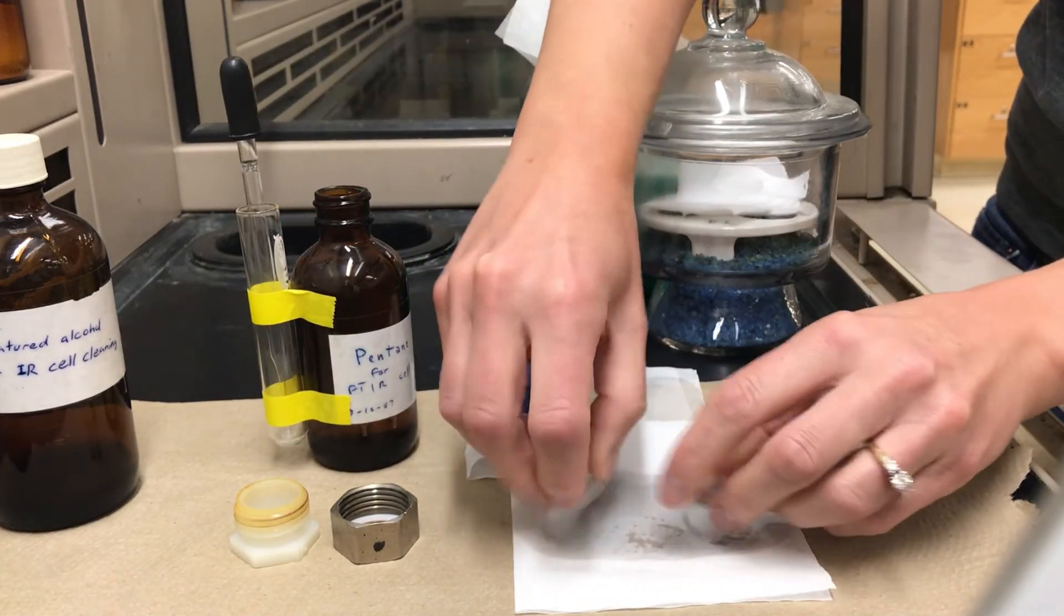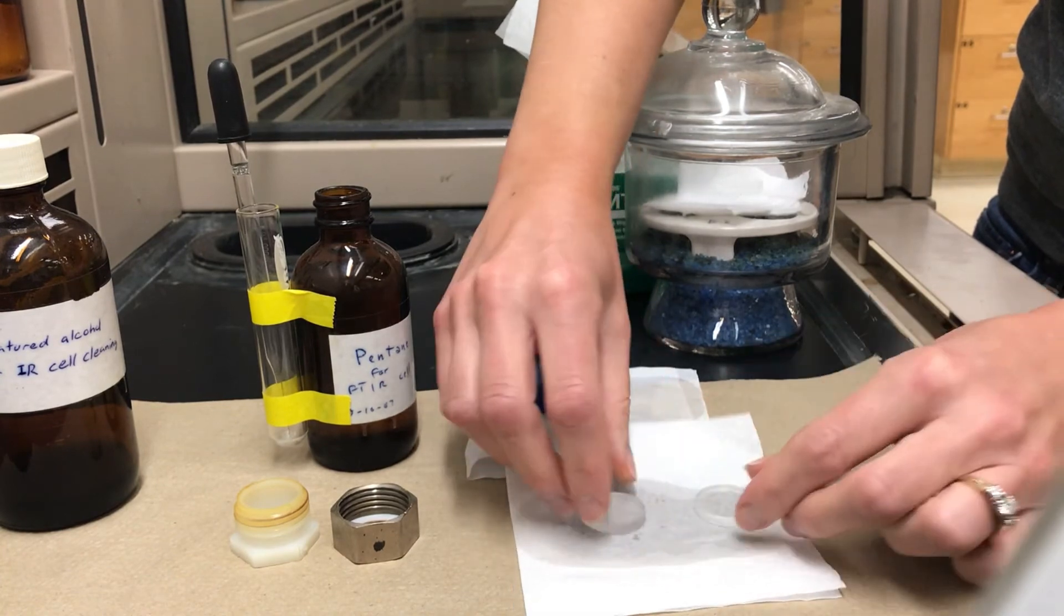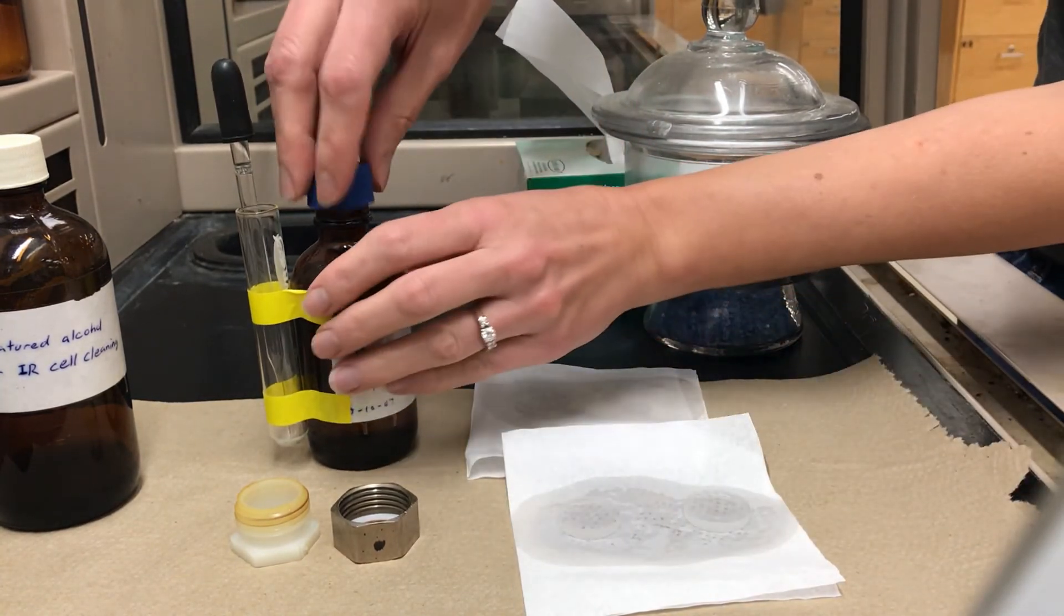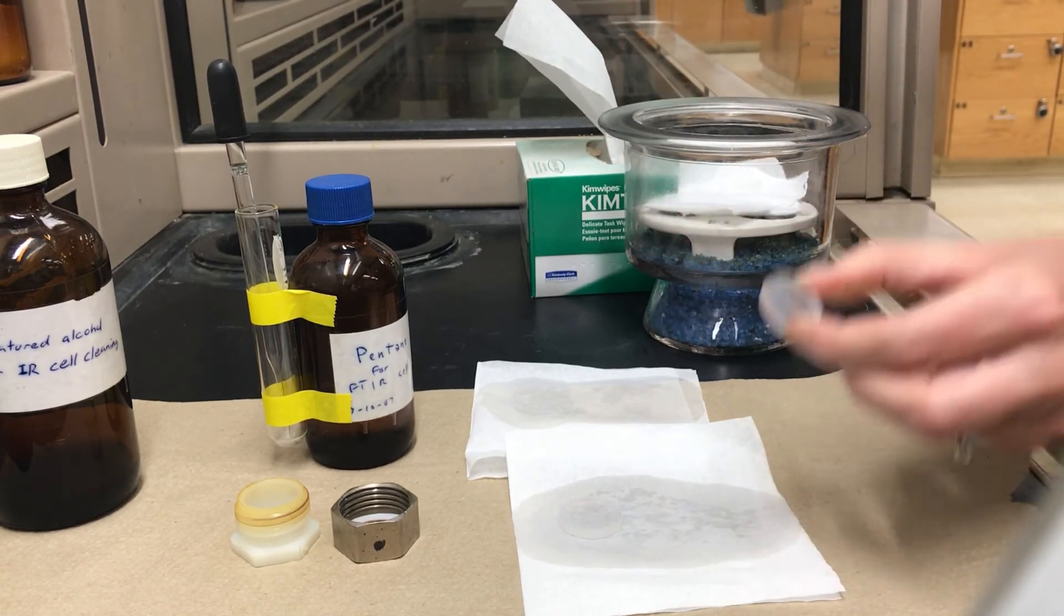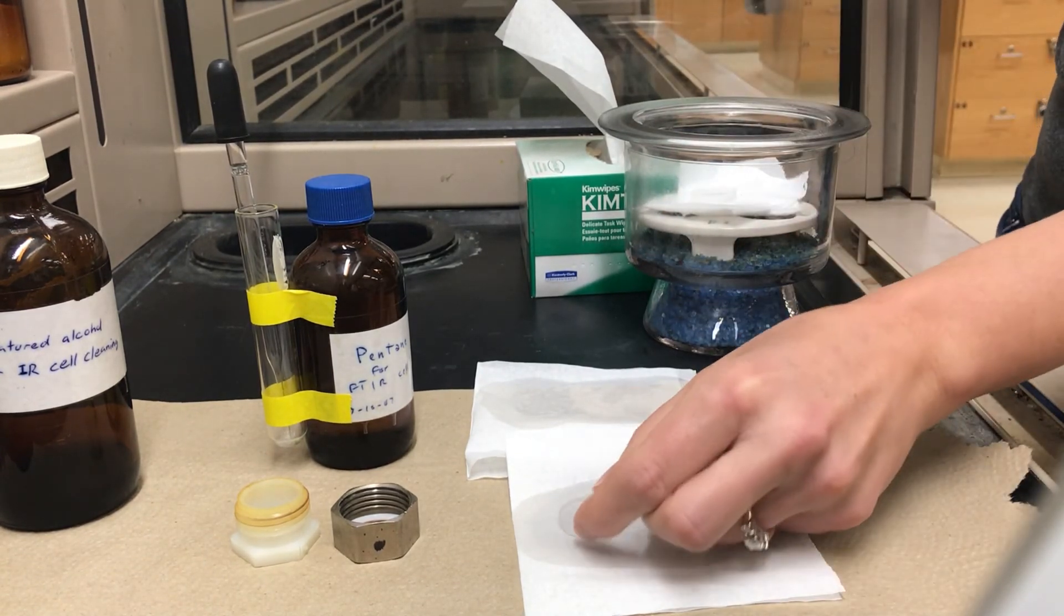Pentane also evaporates quite quickly so you have to deal with it quite quickly but use the same method where you just wipe it around on the kim wipe and then when you're done those salt plates go back in the desiccator for the next person.